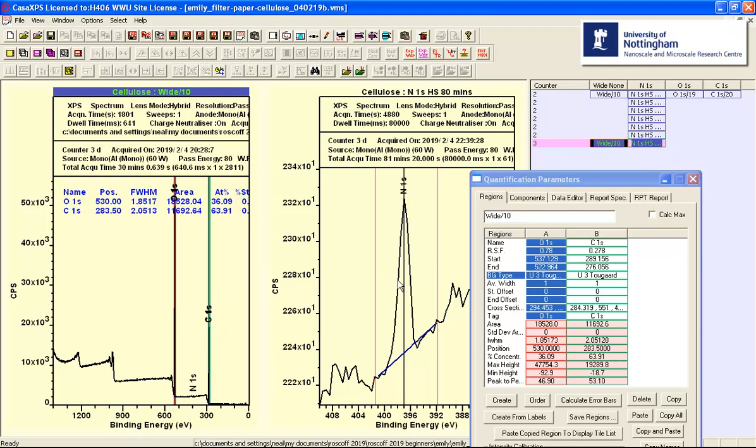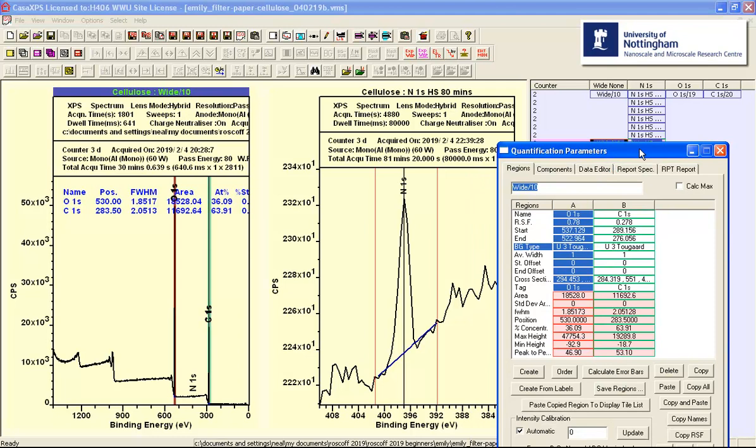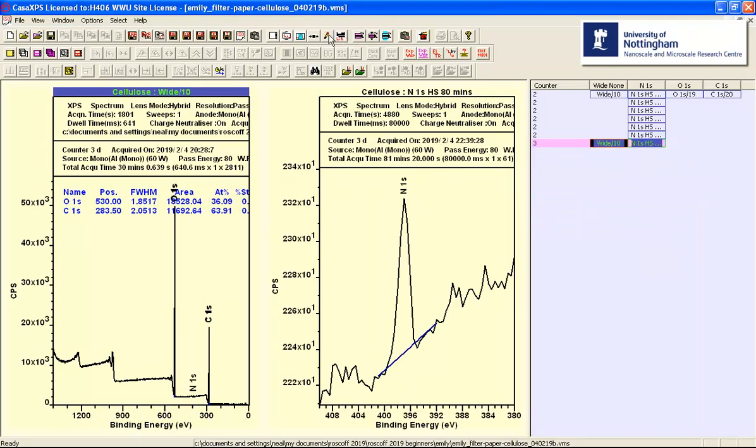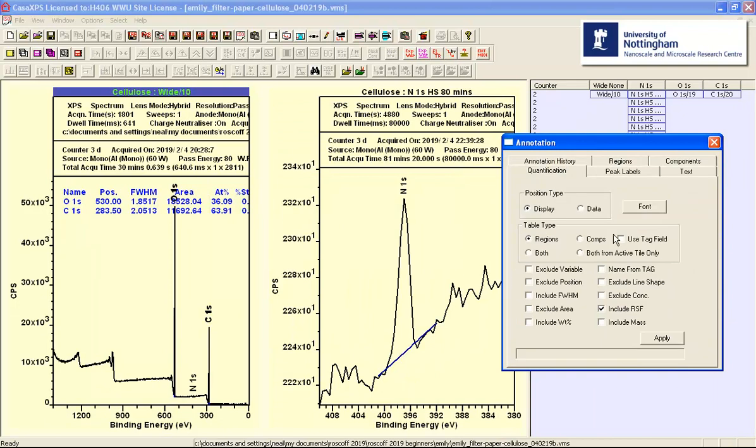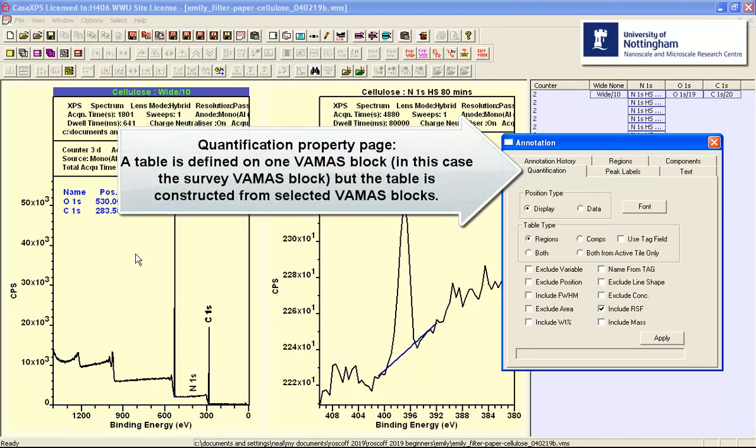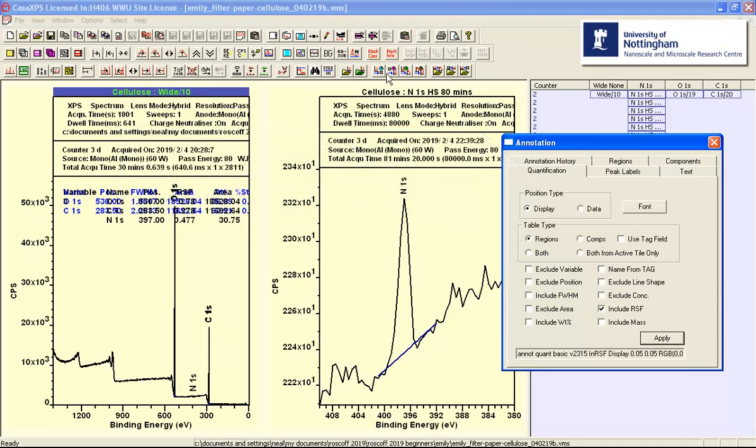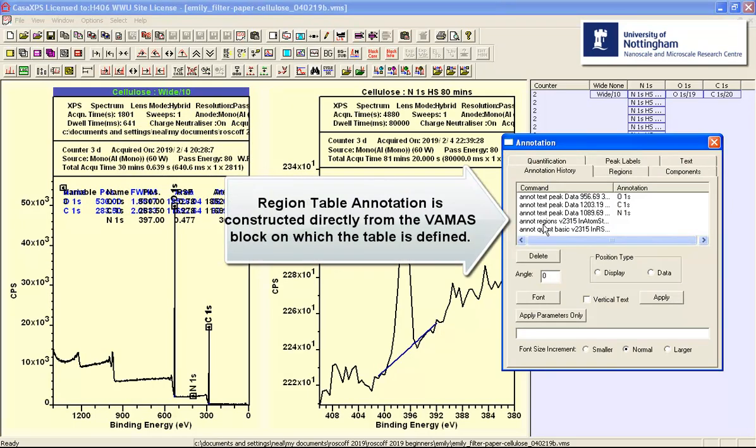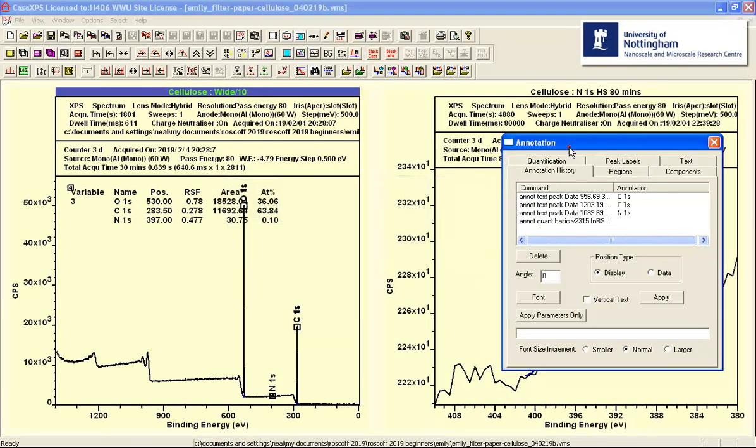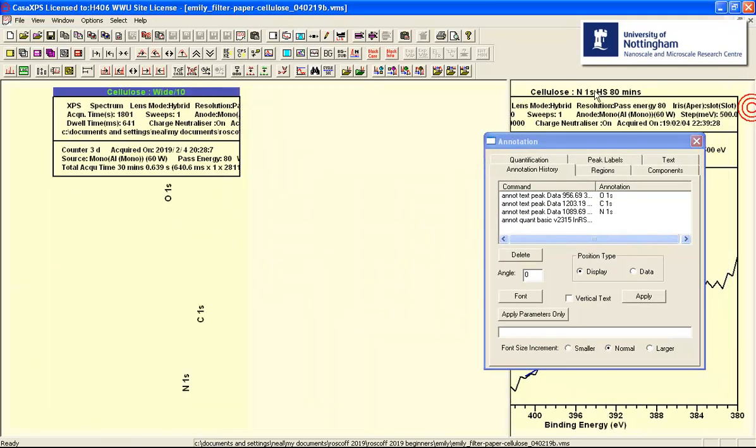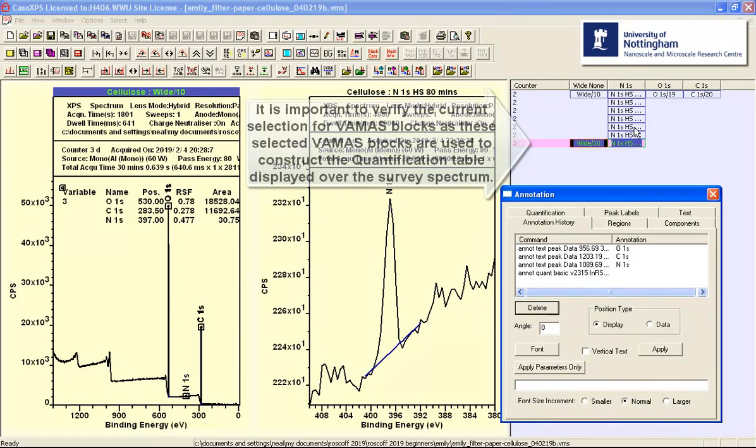But nevertheless, these are peak areas that will be calculated in counts per second EV. So we can quantify these data against the survey data, just as you would do with high resolution spectra. But to do this, I'm going to have to use a quantification table that is defined on the survey spectrum. And we'll include the relative sensitivity factors so we can see these. I'm just going to delete the region table so we can see it clearly.